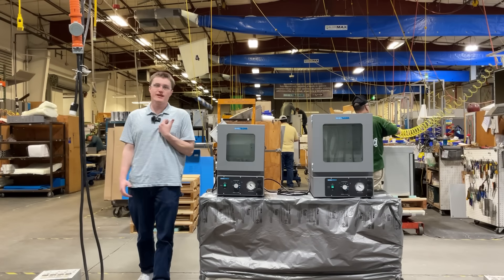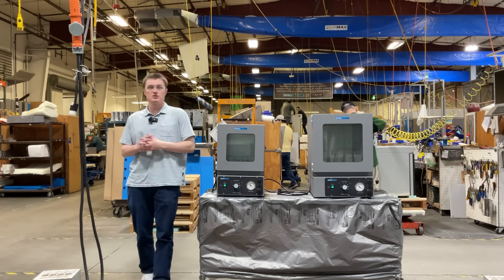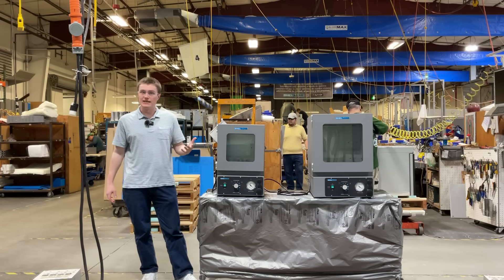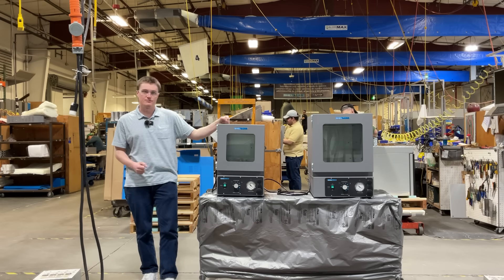Hello again, my name is Kord Sankstake. I'm a design engineer here at Sheldon Manufacturing. Today, I'm going to be introducing the S-Vac-E Vacuum Economy Oven Line of Incubators from Sheldon Manufacturing.